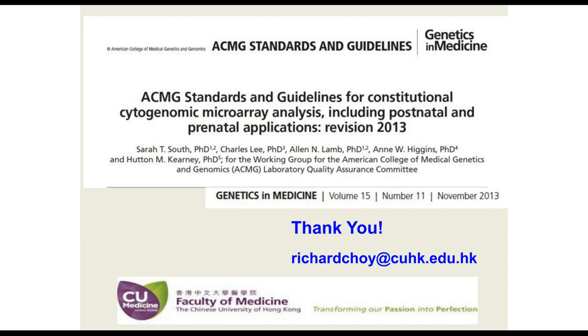So in theory, with that technology, we can take care of both single nucleotide point mutations that currently are taken care of by WES, and we can also look into copy number variants that were able to be picked up by CMA, or even balanced translocations and structural variants that have been developed in our lab. So you can see that actually these two technologies are taking care of different arrays of disease.